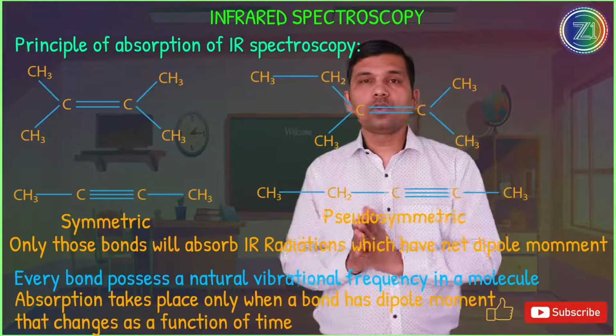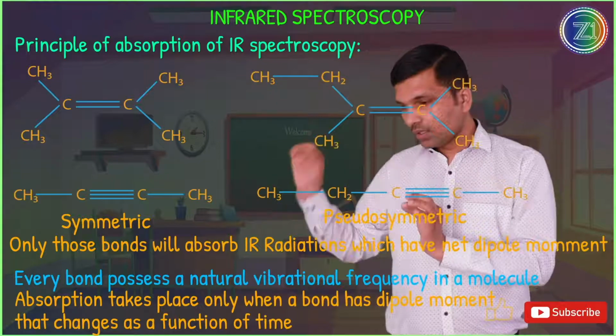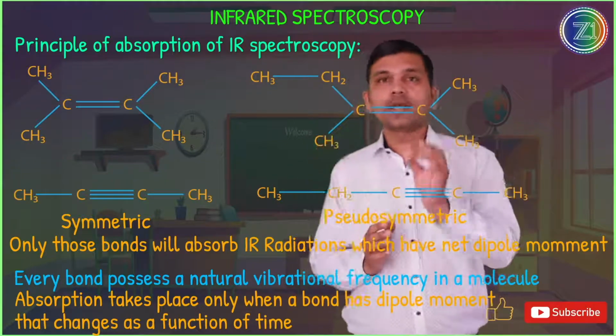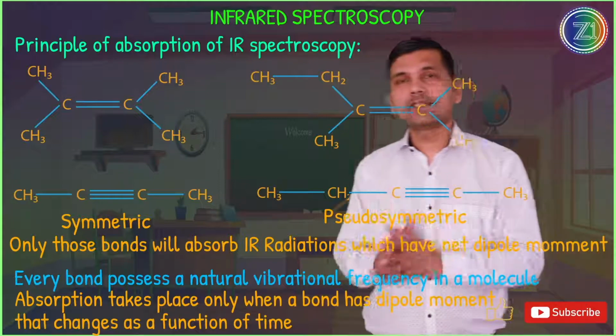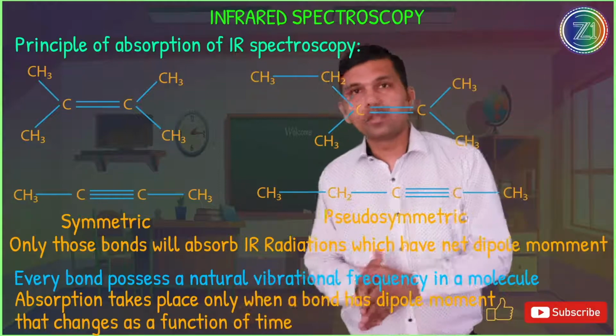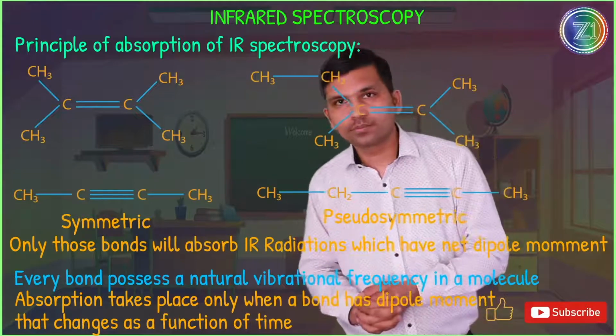Second, I told you how you can convert this wavelength into the wave number. And third, we understood very well how this absorption occurs in IR spectroscopy, inside various molecules.